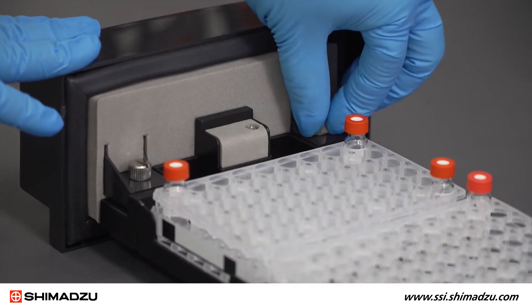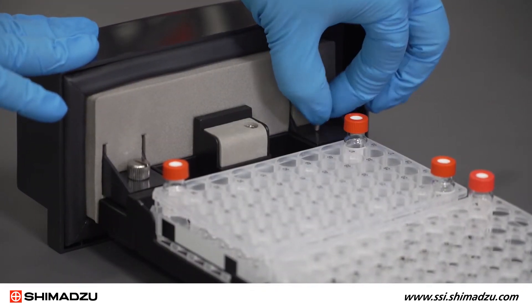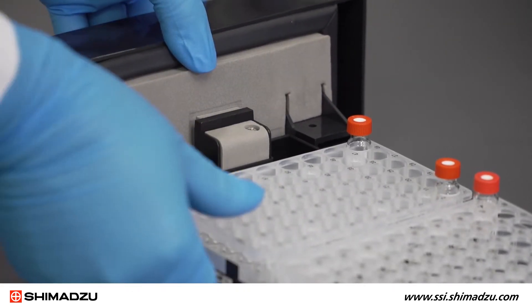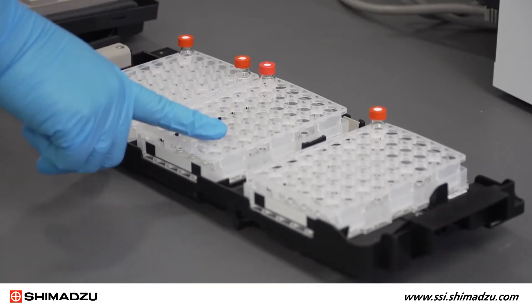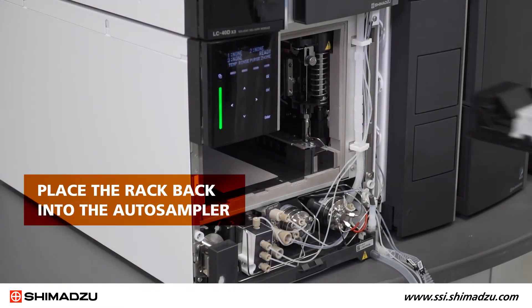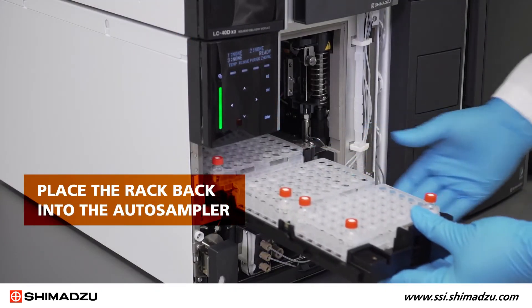Now you must remove the front panel from the sample rack. Remove the two knurled screws fixing the panel to the rack. Next, set the same type of plates in the front, middle, and rear sections of the rack. The adjustment will fail if the plates are not identical. Place the rack without the front panel back into the Auto Sampler.